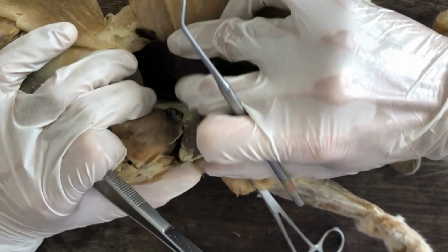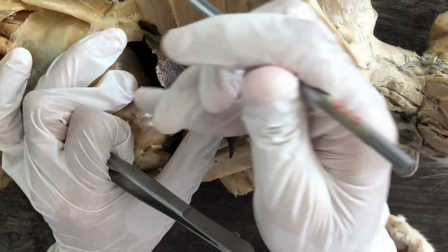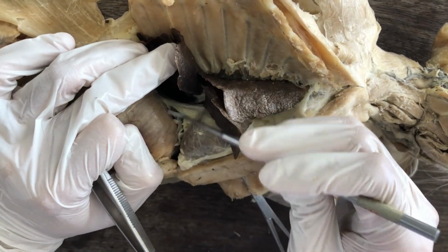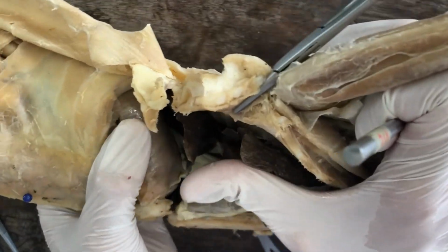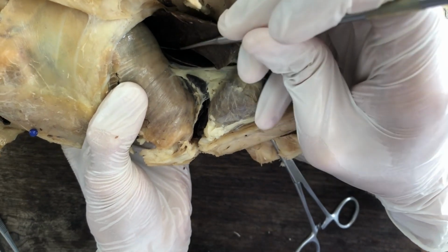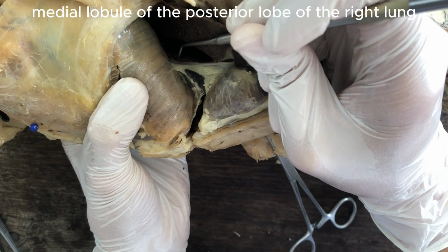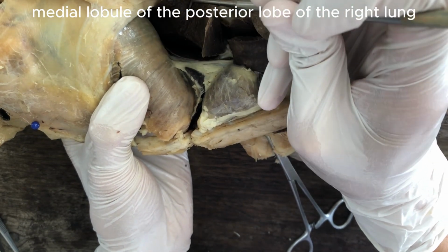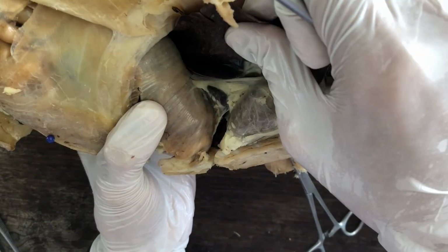And then the one there, when you first open the pleural cavities, it will still be covered by connective tissue. So this one, let me show you. That tinier lobule is the medial lobule of the posterior lobe of the right lung. So there's a medial lobule and there's the lateral lobule for the posterior lobe, right?